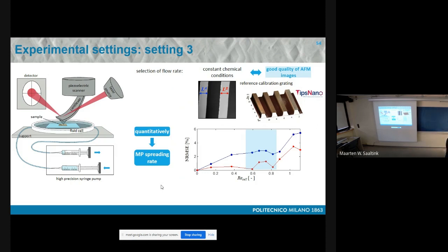Then regarding your results, in the experiment you have been working with, you are working in certain conditions of chemical solutions. Yes. The experiments basically were close to equilibrium or near equilibrium. And all your statistics were applied under these conditions. Yes. So the point is that, depending on where you are, let's say the delta G region, you will have to apply different statistics all the time. It might. In the sense that this interpretation is used for a certain value of delta G, let's say that observation state of the solution. If you change that, then you will have to change all the analytical exercise.